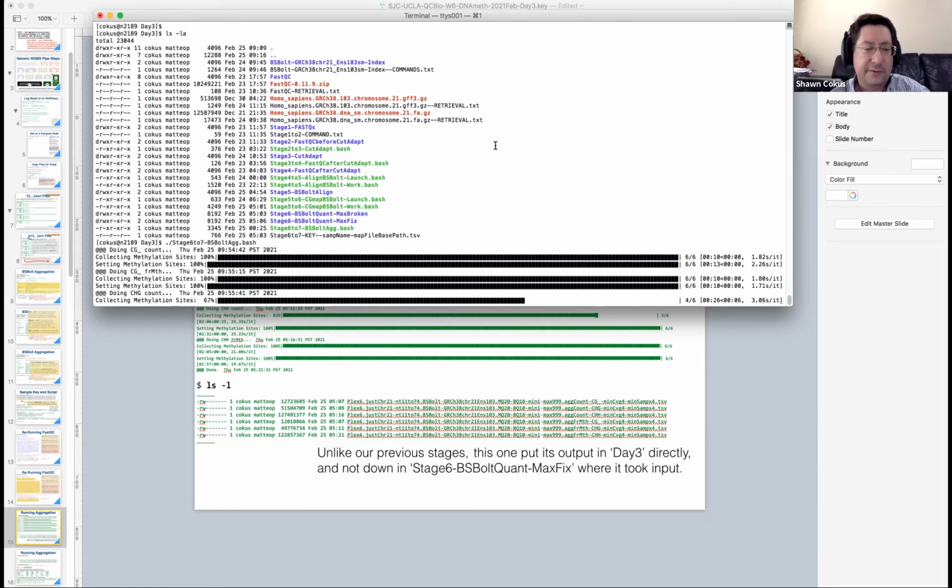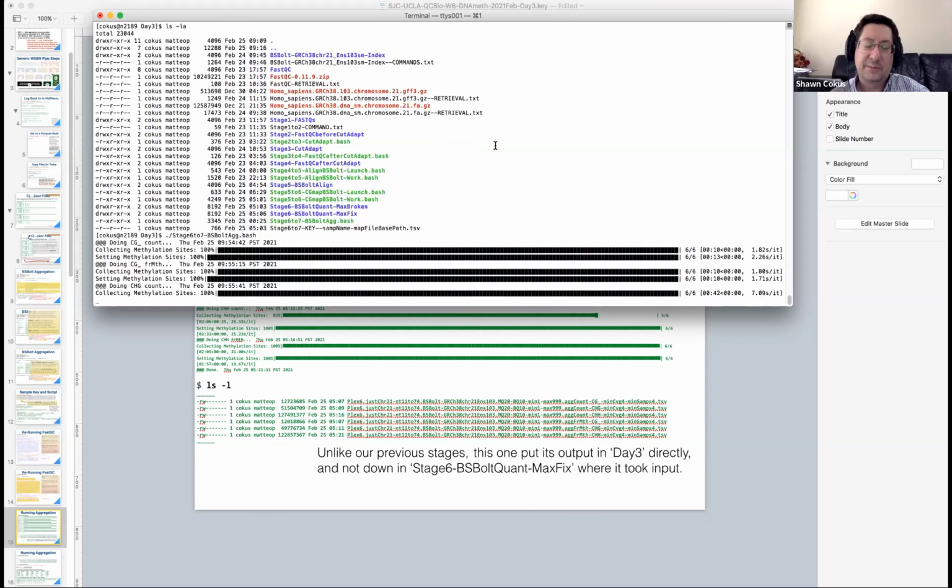Pretty reliably for me in here somewhere, there's a progress bar that doesn't look like it finishes, like it just stops in the middle and never updates. The program is fine and it ran okay. And usually when you write programs that generate progress bars, if the progress bar doesn't update continuously, if it's incremental with delays, you guarantee that when you finish your loop, you force the progress bar to be at the end, because it's not good to leave the user hanging and see a half completed progress bar when you're actually done, and then they wonder, well, what happened?